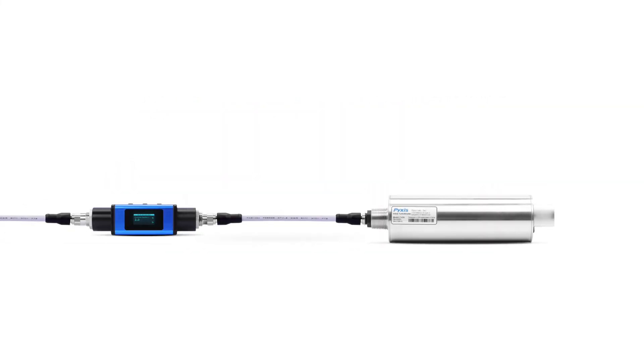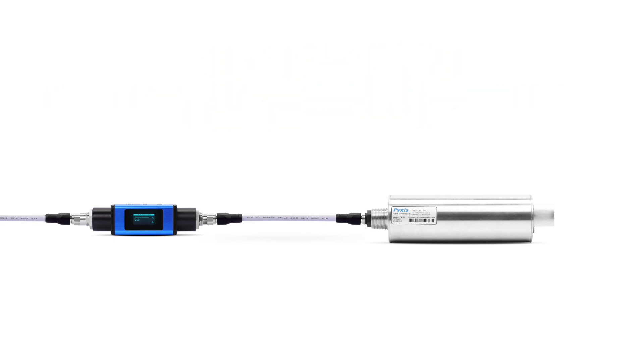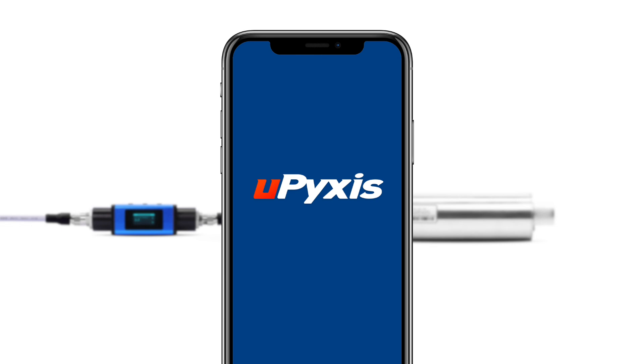The LT635 may also be connected to our MACR inline Bluetooth adapter for wireless programming of the sensor wiper for a cleaning sequence, live sensor measurement display, diagnostics, cleaning and calibration, all on the uPixis mobile or desktop app.